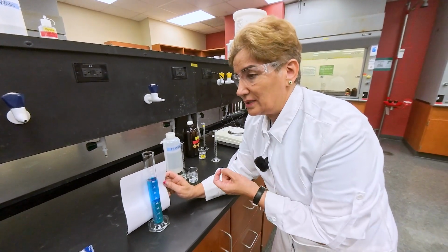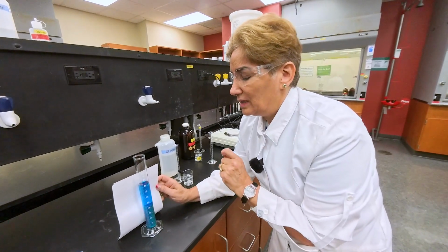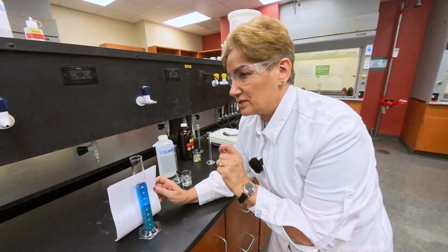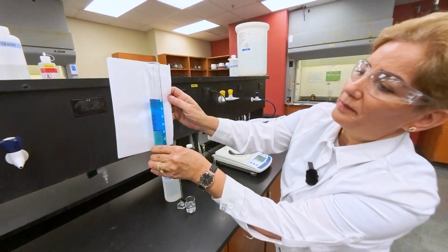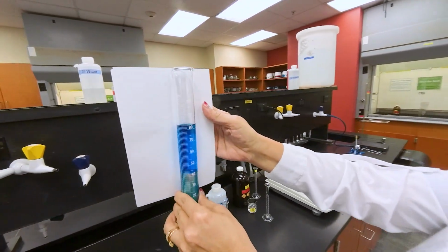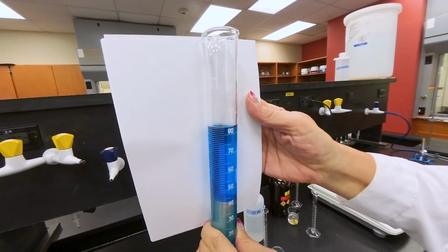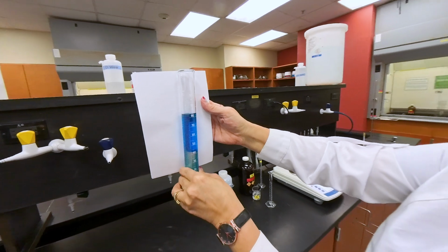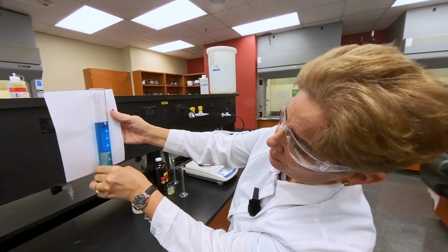So when you are recording the number as the volume of the solid, you should change the unit from milliliter to cubic centimeter. So we're going to look at this number and record this number as accurately as possible. It's between 82 and 83, and you estimate that number closely.